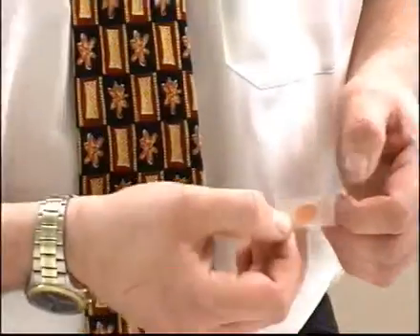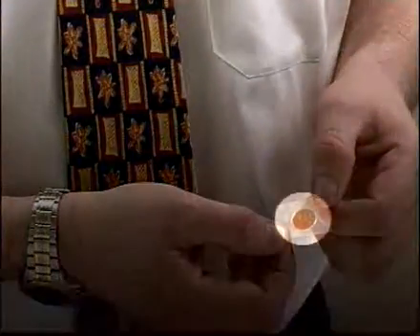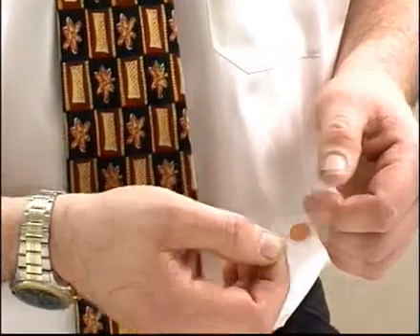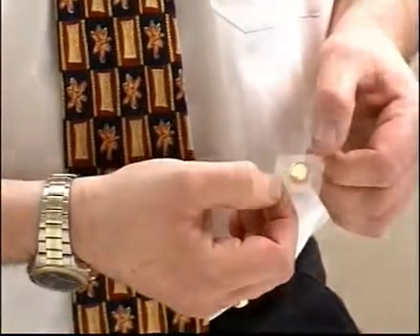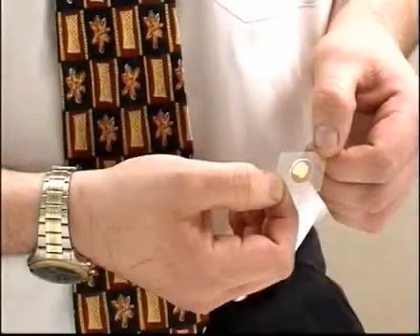Compare the result on the pad to the examples on the inside cover of the box or in the instruction manual. If there is no yellow or only a very faint yellow, the water is fresh. If a large yellow patch appears, the sample is contaminated by salt water. You should always check a positive reading by repeating the test.